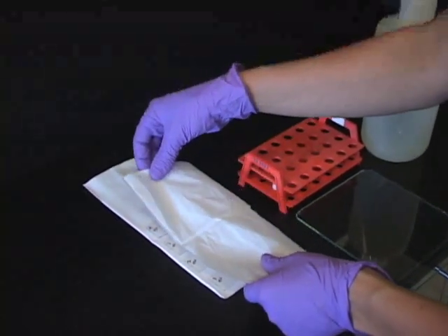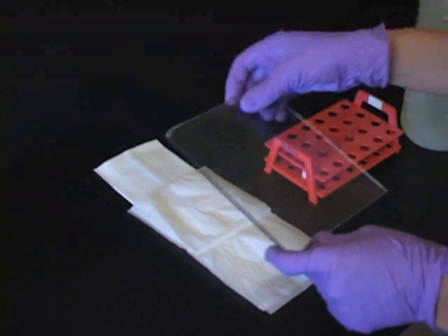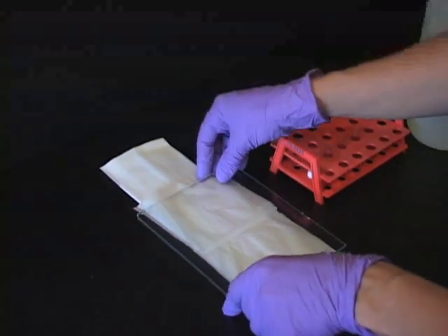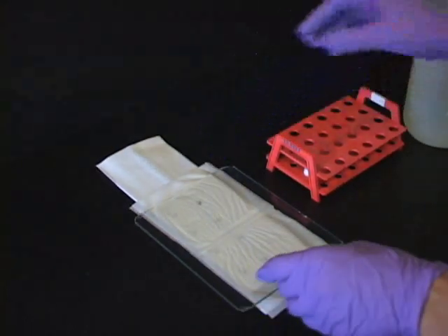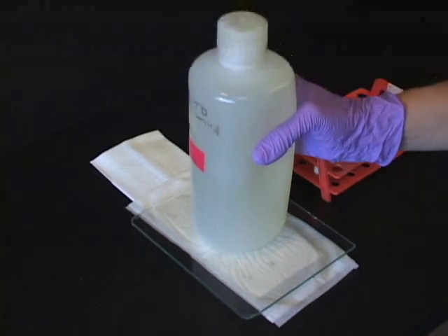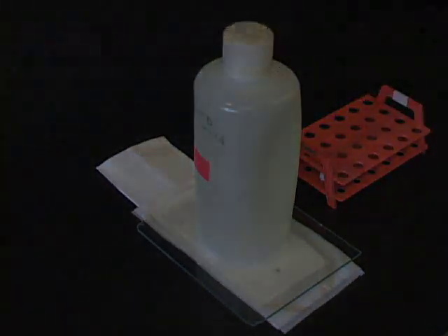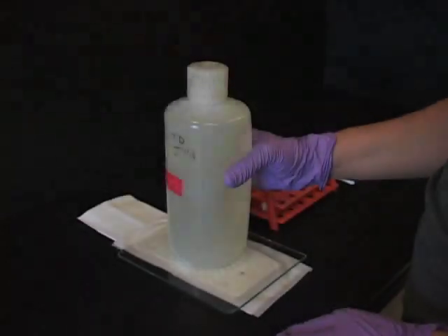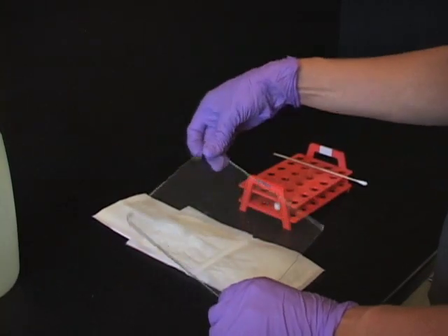Cover slides with kimwipes, a glass plate, and squash by placing a 1 liter bottle of water on top of the glass plate for 5 minutes. Gently remove the bottle, plate, and kimwipes.